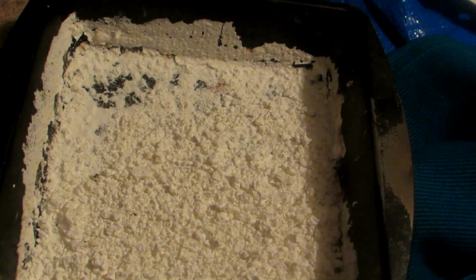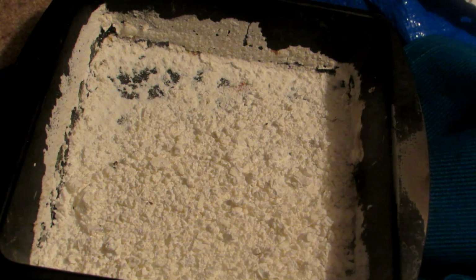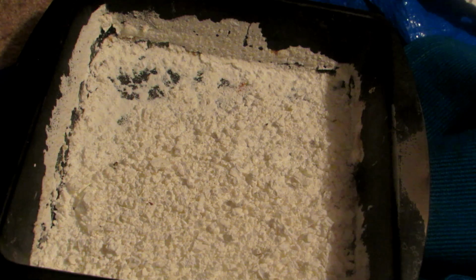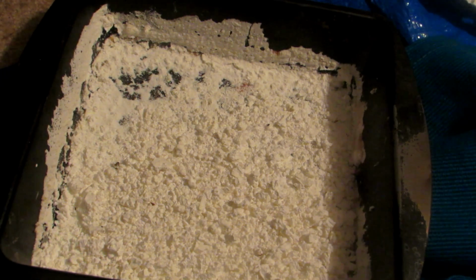Okay, so you can see that after filtering off that mixture again, we simply transferred it to this dish and heated it up in the oven to about 400 degrees Fahrenheit. This decomposed all of that silicic acid into silicon dioxide and water, and I will write up the equation for that in a moment. And you can see we're left with this nice white powder.